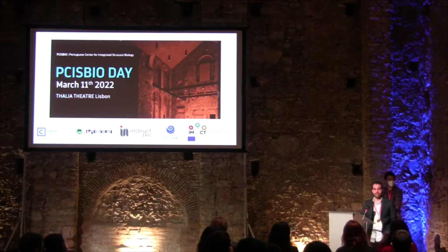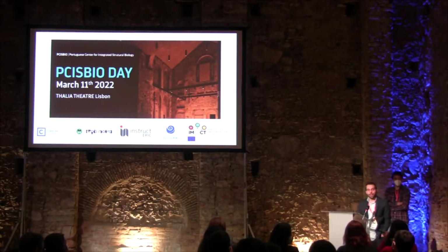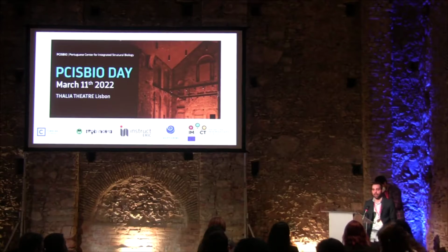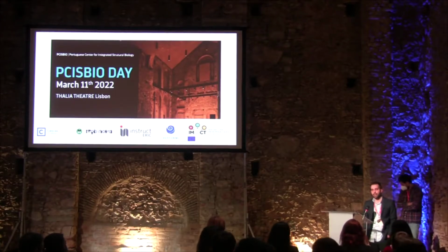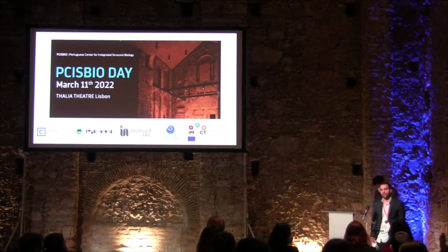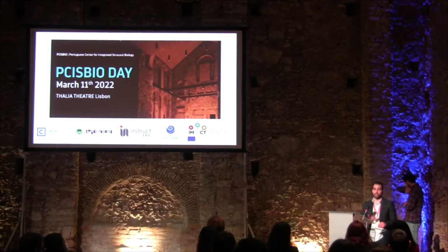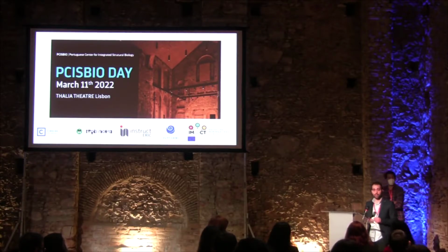And how long does the process itself take? Because I don't know anything about this system. Except just avoid the part that you have to submit the Instruct proposal. So like, is it a week in the lab or 2 months? So the preparation of samples, we need to prepare the samples, the plasmids, and send to the Instruct center.